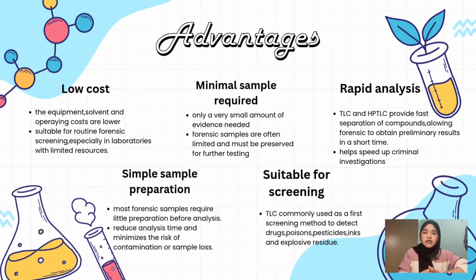The next advantage is simple sample preparation. Most forensic samples require very little preparation before analysis. This not only reduces the time needed for testing but also minimizes the risk of contamination or sample loss during handling. Finally, TLC is suitable for screening.